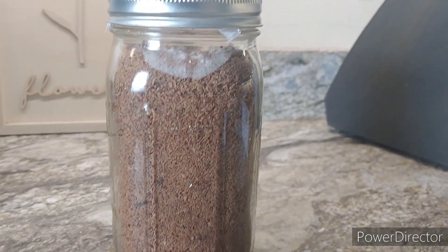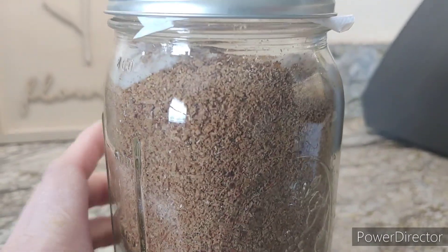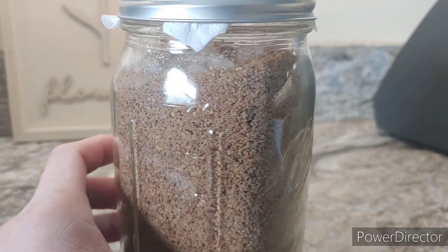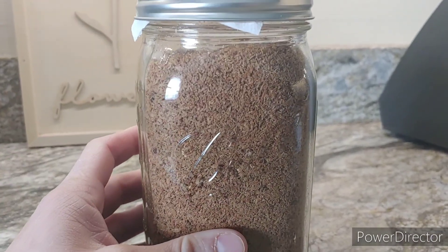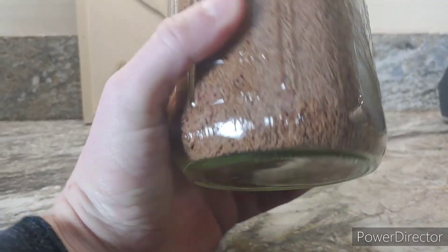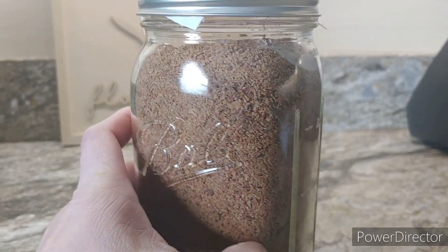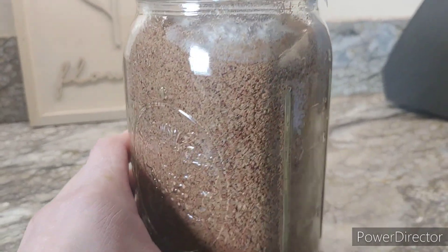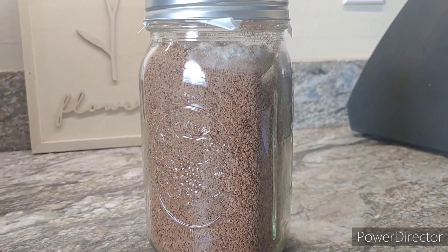And here we are a few days later — we've already got mycelial growth starting to take over the jar. You can just see it at the top for now, but remember the core of this also has the mycelium in it. I'm not seeing any other spots where it's popping out yet. Pretty cool — take care guys.